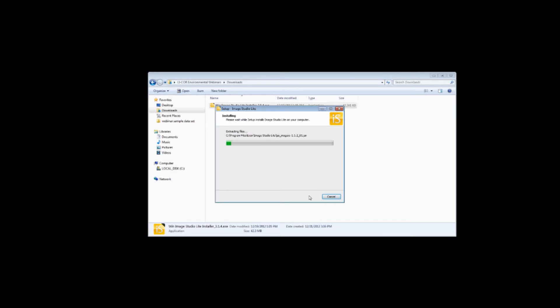If you receive a security warning, choose Install the driver software anyway. Then click Finish.